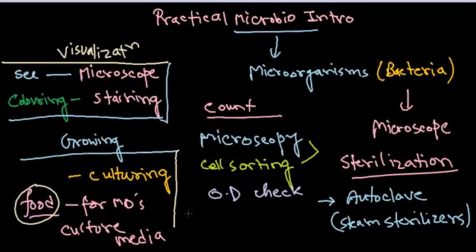And we need glassware like petri dishes, because it has a large surface area so that the bacteria can easily grow, because they usually grow on top of their food matrix, right? And for counting them you also require a microscope, and for OD checking you require different colorimeters. So many machines are required for this process. If you are a microbiologist and start doing your lab work, you start to see many different basic machines that should be there.